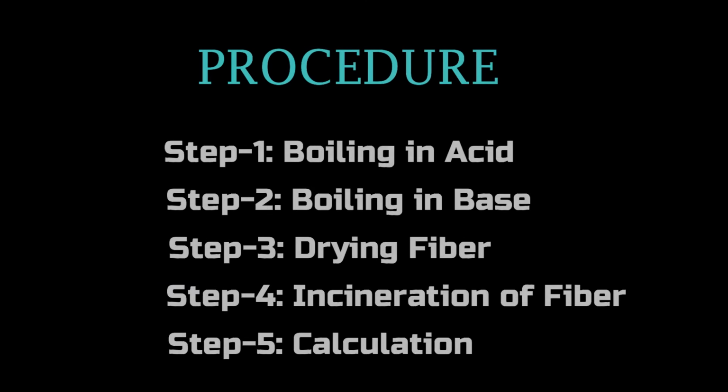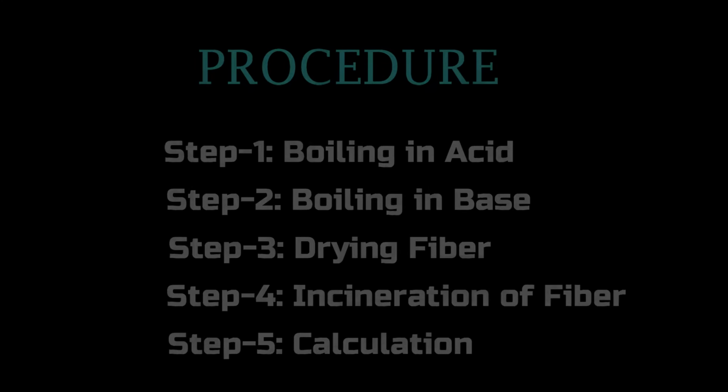We can analyze a sample for the crude fiber content by following 5 steps: boiling in acid solution, boiling in base solution, drying fiber, incineration of fiber and calculation.